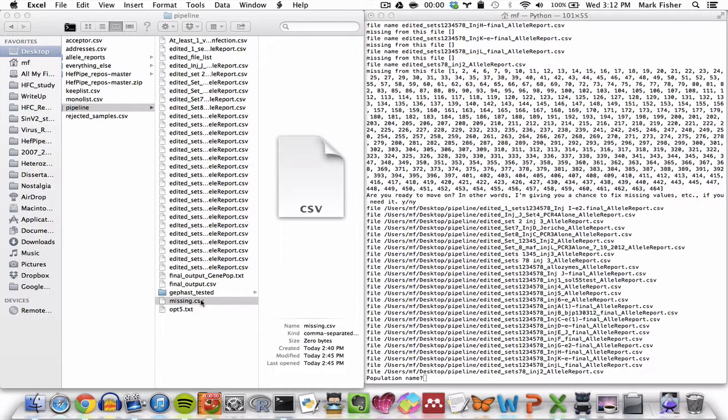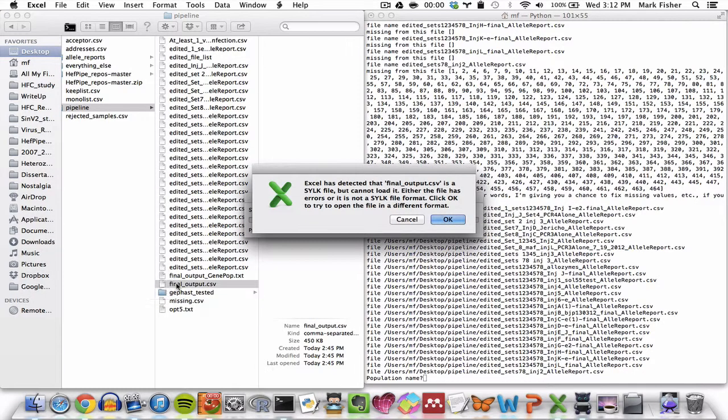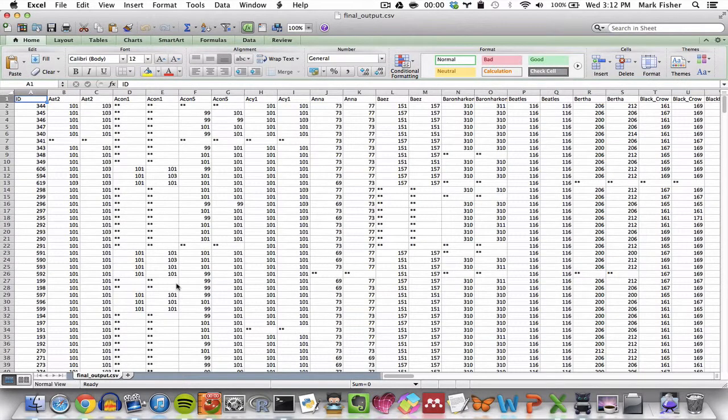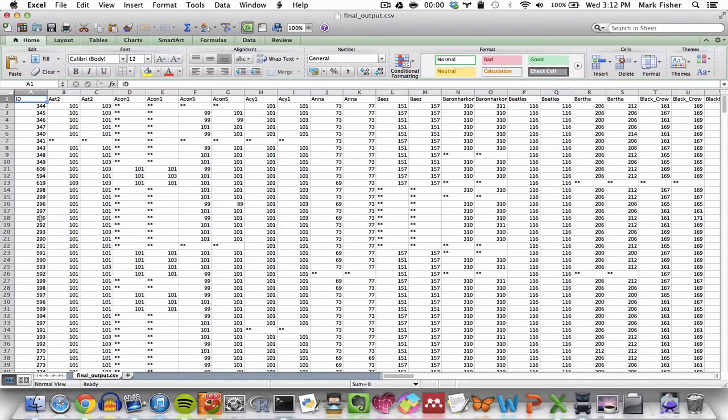At this point the pipeline also generates a file called final output.csv right here. And that contains the genotypes of all the relevant samples at all the relevant loci. So samples on the rejected samples list will be missing from this data set, and missing genotypes will be noted with two asterisks. Note also that this file is not sorted by ID.